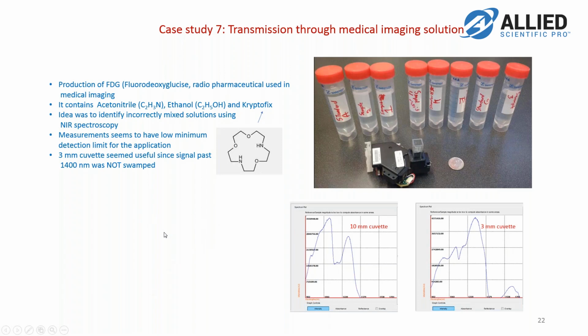Most of them worked, but there were a few of them that did not work, and this is one example where we didn't have enough minimum detection limit.